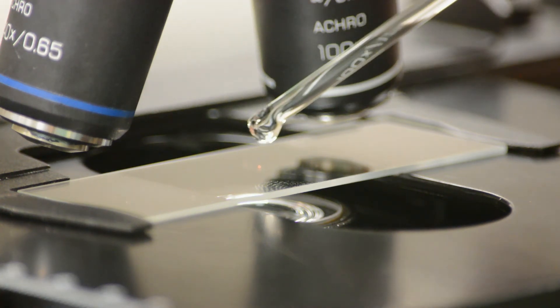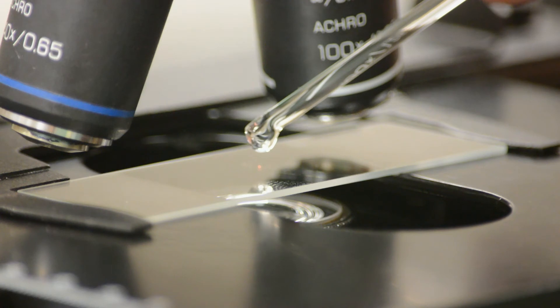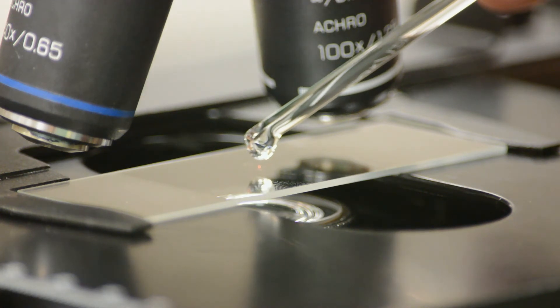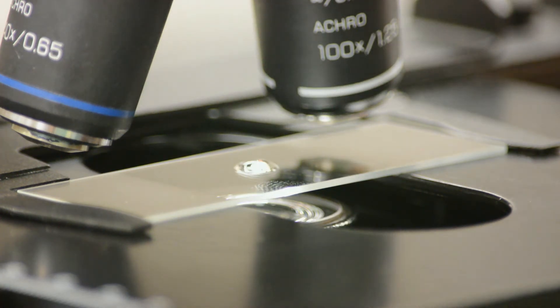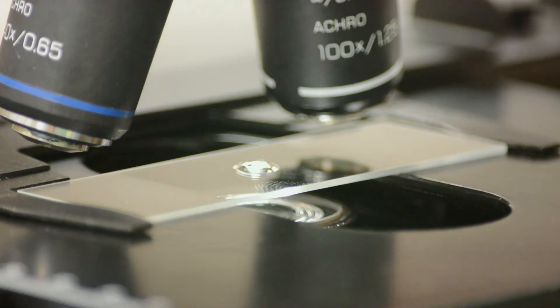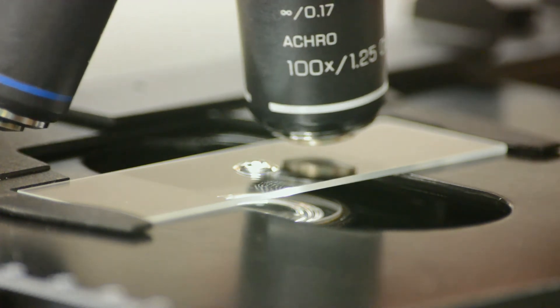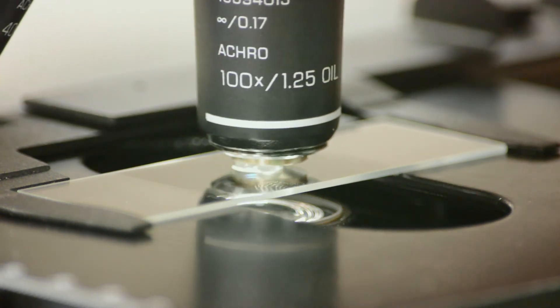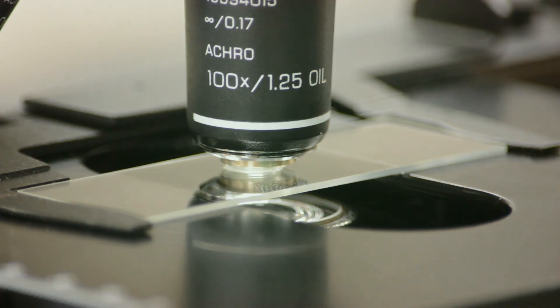We then take our immersion oil. We place a drop of the immersion oil in the center of the slide. You can see the little glass dropper coming in. You place a drop of the material in the center of the slide. You then rotate the oil immersion objective into the oil. You will see that the oil will actually touch the objective.